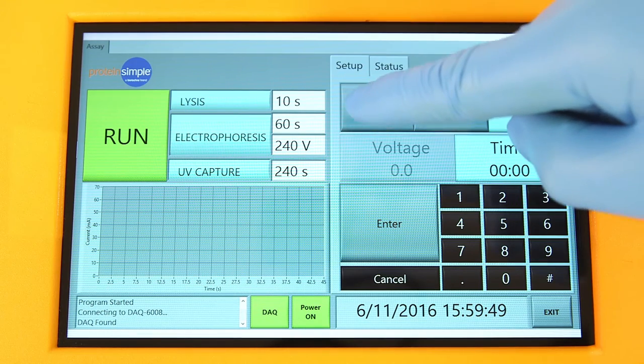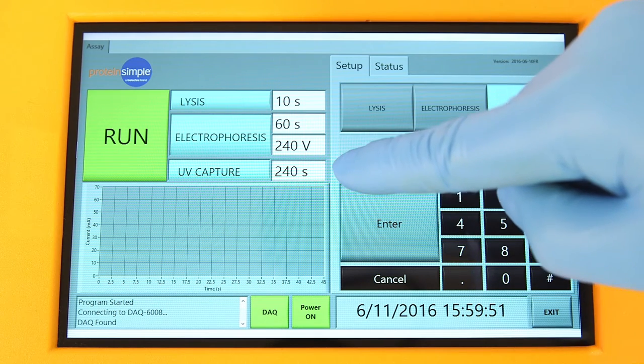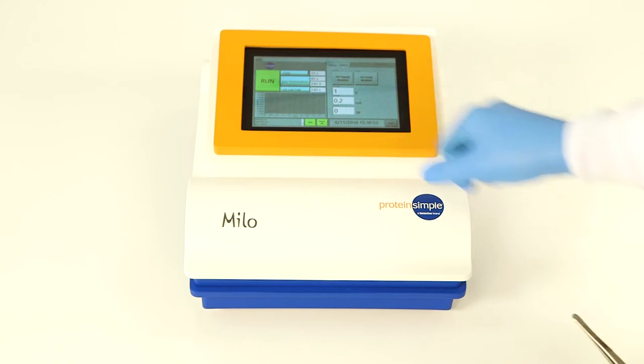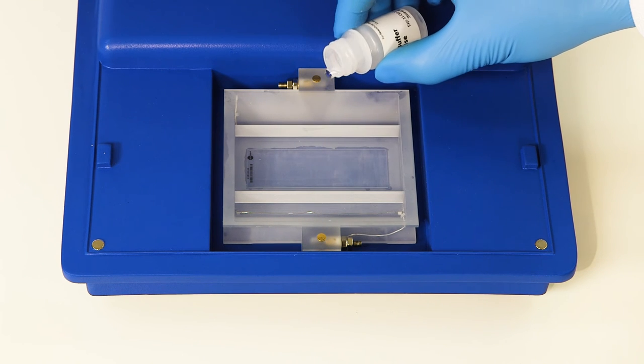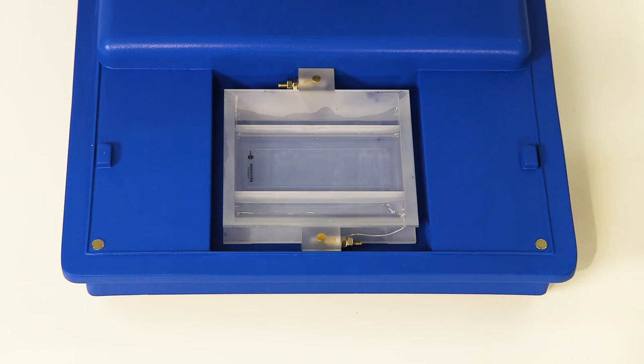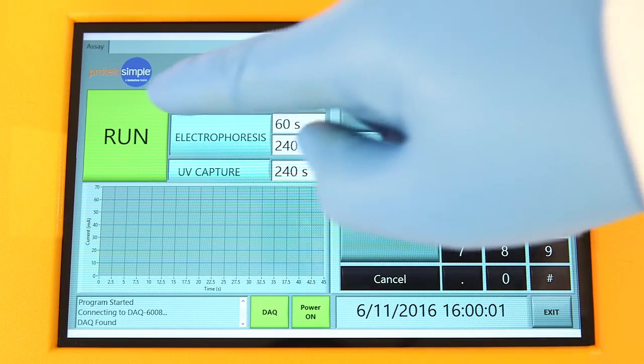We recommend checking your time parameters one last time before adding your lysis buffer to the center of one of the electrophoresis cell reservoirs. After you add all of the lysis buffer remaining in the vial to the reservoir, quickly close Milo's lid and hit run.